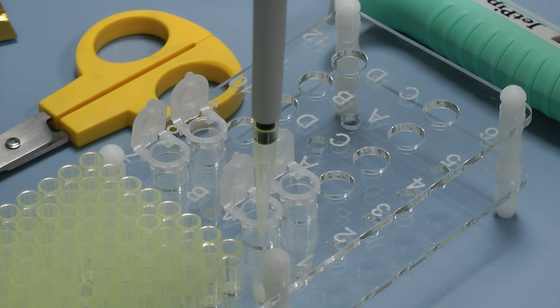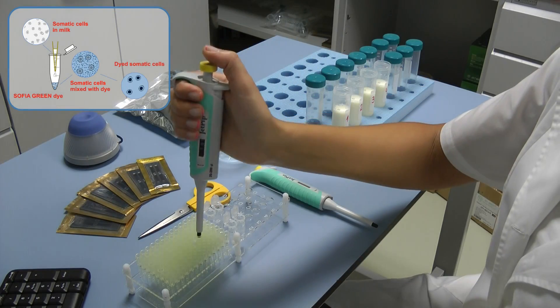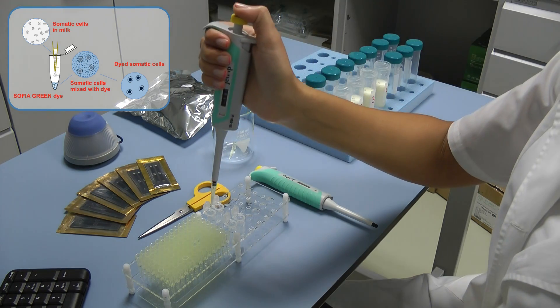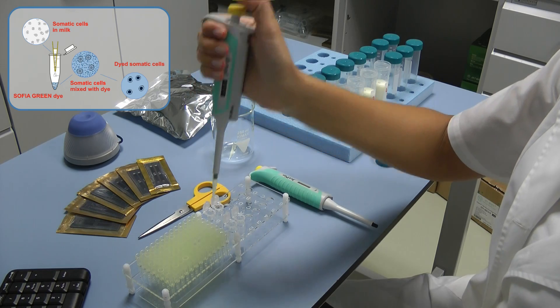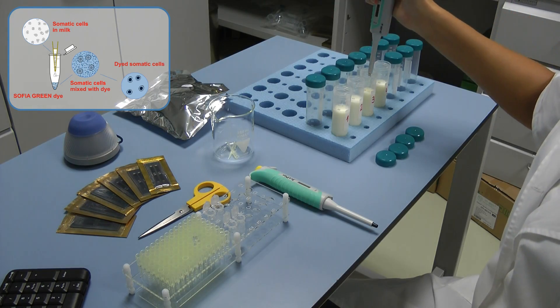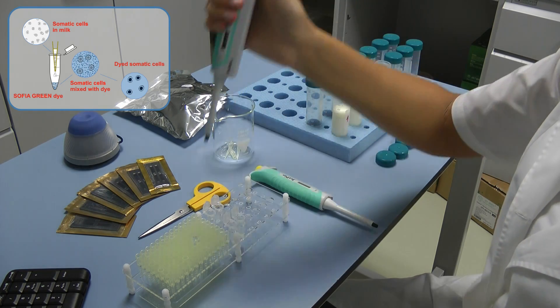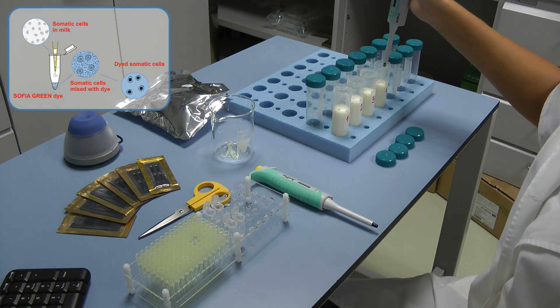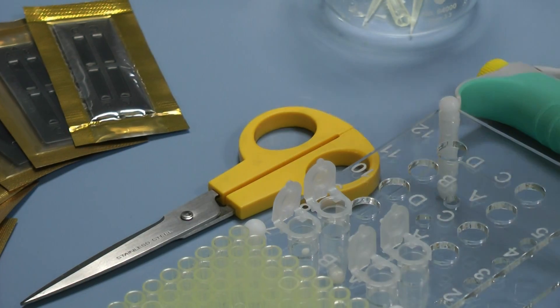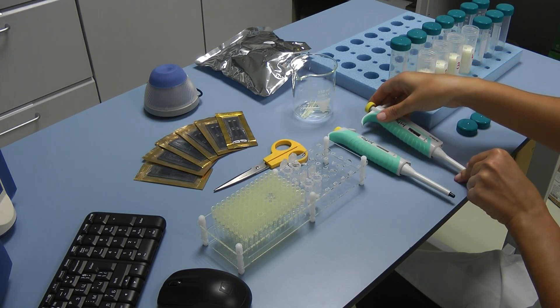Pipette the reference solution in the open microtube on the rack by smoothly pressing the working button of the pipette from the initial position to the first stop. After a short period, press the button to the second stop. In this way, you'll empty the tip and will guarantee precise pipetting. Always pipette the reference solution without dipping the tip in the lyophilized dye. Release the button to its initial position. Press the button for removing the tip and remove the tip in an appropriate garbage can.